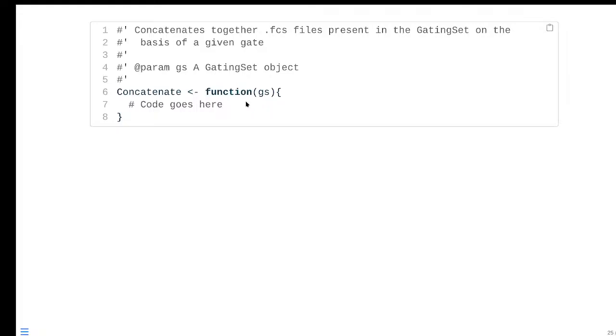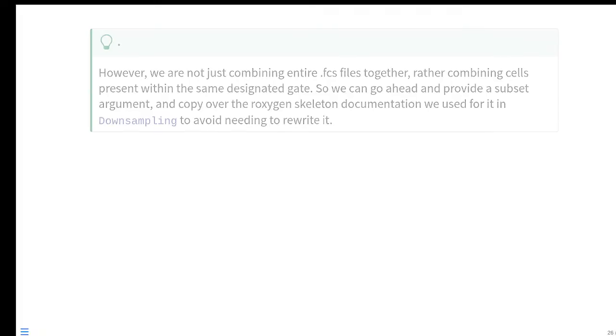And as you may remember, when we're creating a function in R, when we put that assignment arrow at a particular name, that name becomes the name of the function that we're going to be able to use. At this point, the function is just everything that's within the little curly brackets. We haven't built it out yet, so I'm just going to put a placeholder, which is being hashed out, so it shows up as a comment within our actual code.